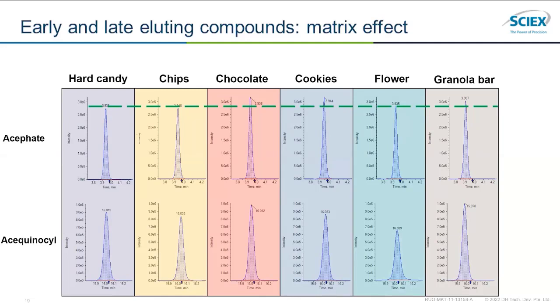So when you're taking it out of the freezer, for example, you're letting it come to room temperature before opening it. You're not letting any condensation get in there. It can be a pretty valuable sort of flag for when it's time to throw out that calibration curve and maybe make a new one.